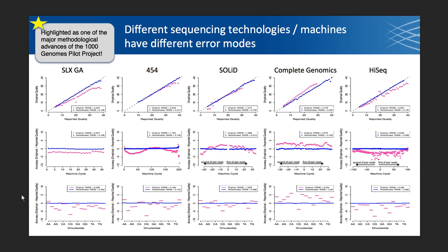For the middle row, we have machine cycle — this is the order in which the bases are read off the read. The first base is the first cycle, the second base is the second cycle, and so on through the length of your read. For paired reads, you have your first of pair and your second of pair reads. You want to indicate that because typically the second read on the other end of the fragment will be of lower quality overall. On the y-axis we are plotting the difference in empirical versus reported quality, and you can see these different samples from the different sequencing platforms have different patterns of bias.